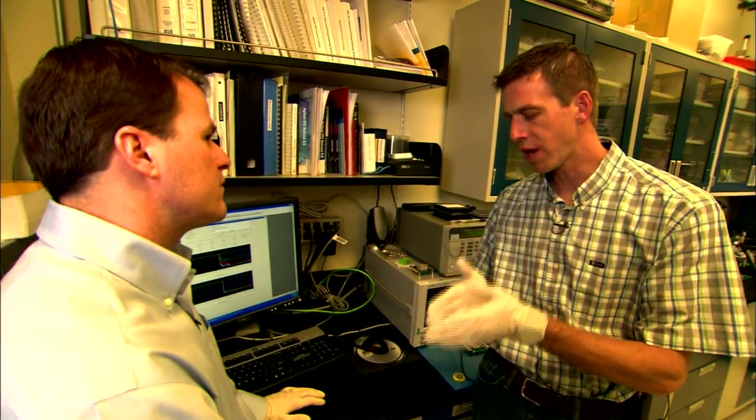One of Sandia's first steps relied on computational innovation. When the project was being developed, we wanted to design a sensor that allowed us to measure and rapidly detect antigens in solutions.